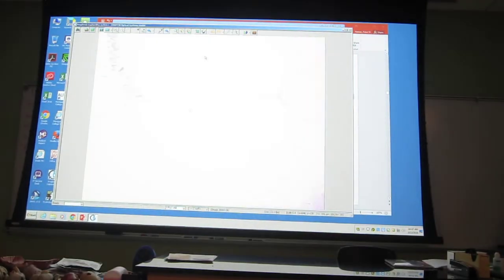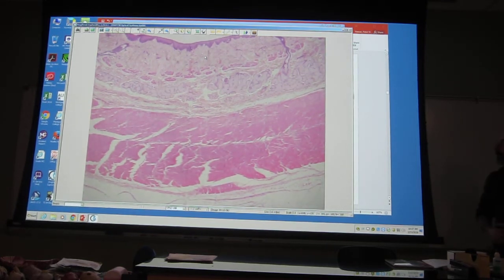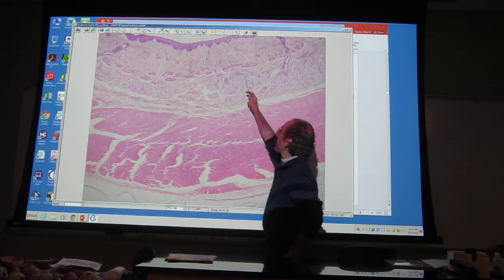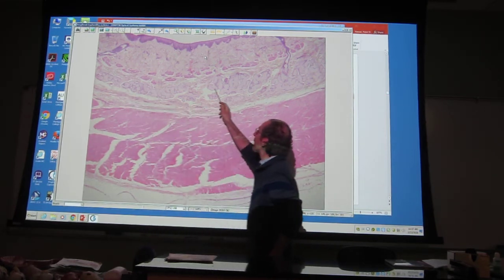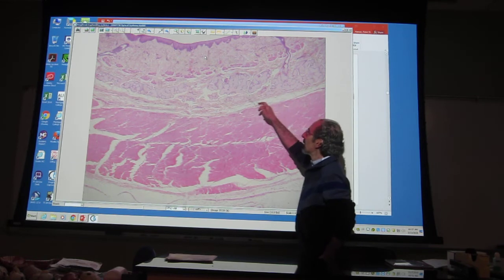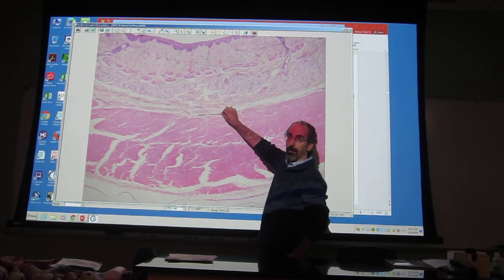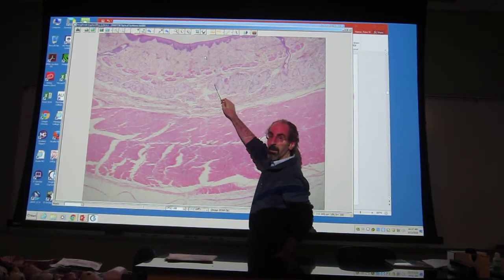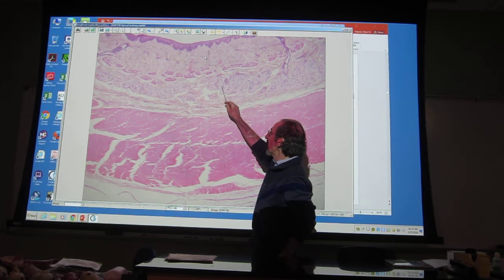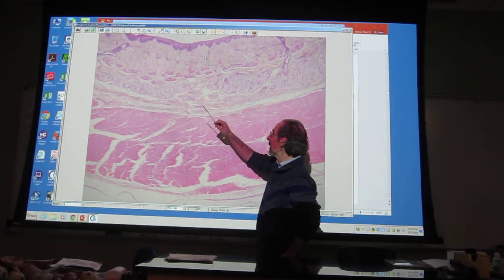Below that, we have these puffy white clouds. This is part of the submucosal layer. The submucosal layer starts really right about there and goes down to about here. Incorporated into submucosa are your mucus glands, sometimes called esophageal glands in the submucosa.